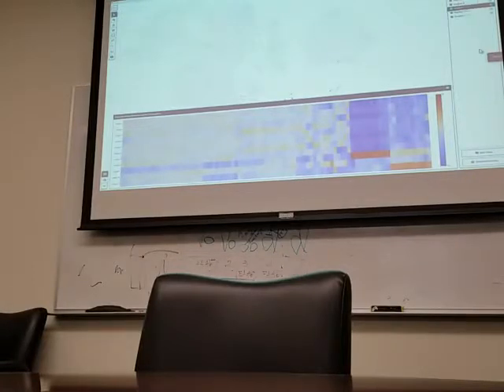Yeah, so we're off the track trying to figure out why all the B cells don't express all the genes B cells should. I think it's mostly just cluster 9 and 11 that are. Right, yeah, it is. So, cluster 9, 11, we will eliminate them from every plot we make, and it'd be nice to eliminate them from the analysis. So then I guess you can't go and redo another embedding without those cells, can you? That would be nice to do.